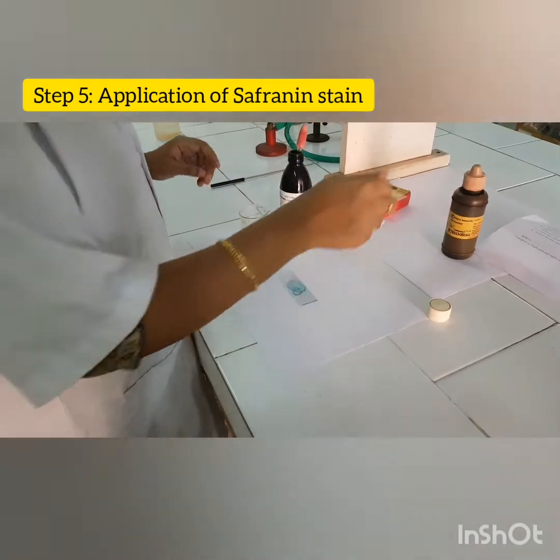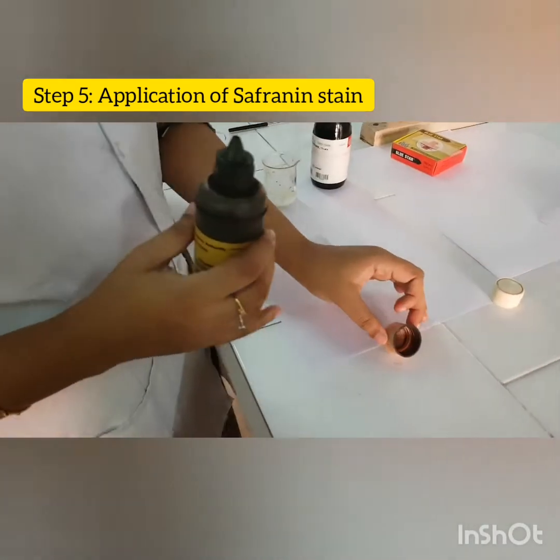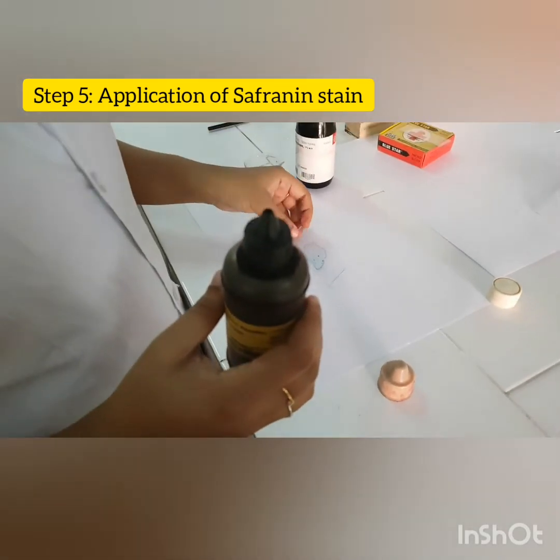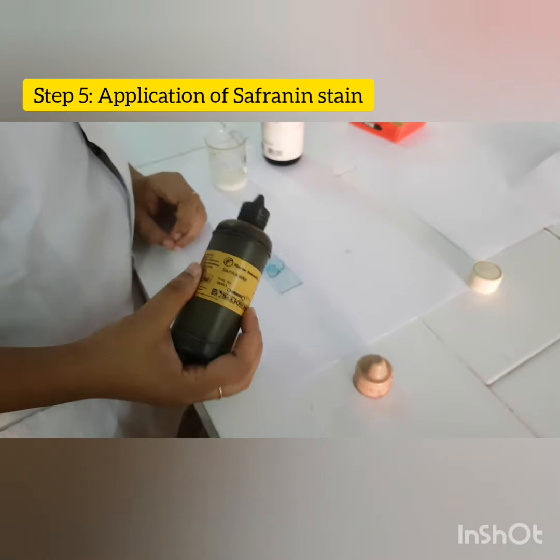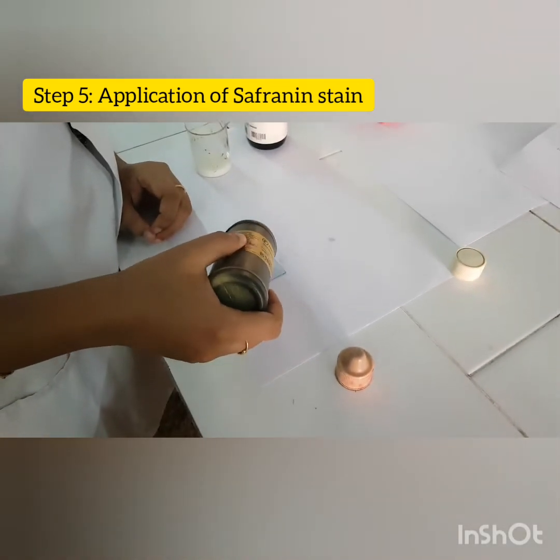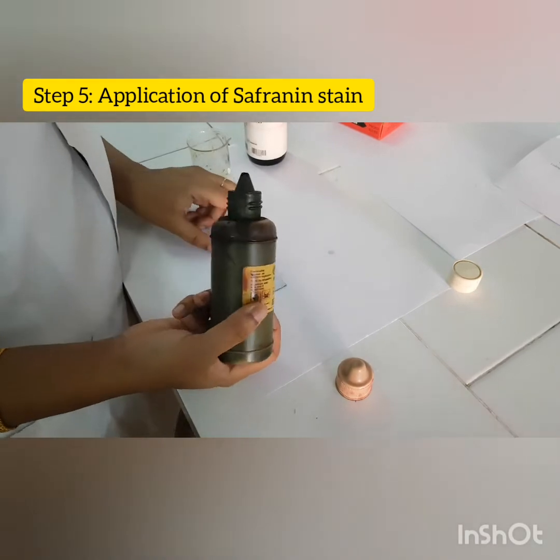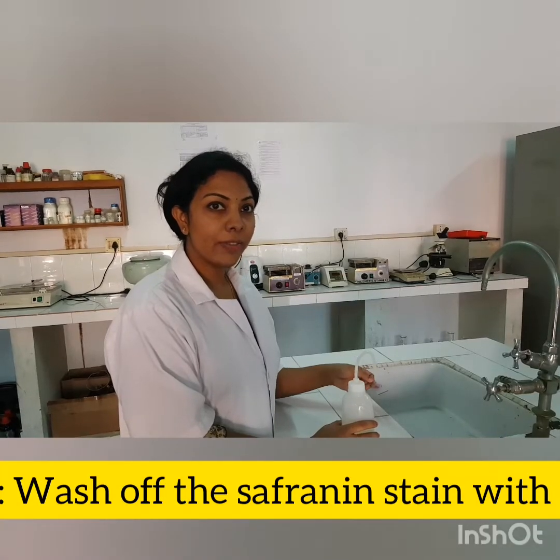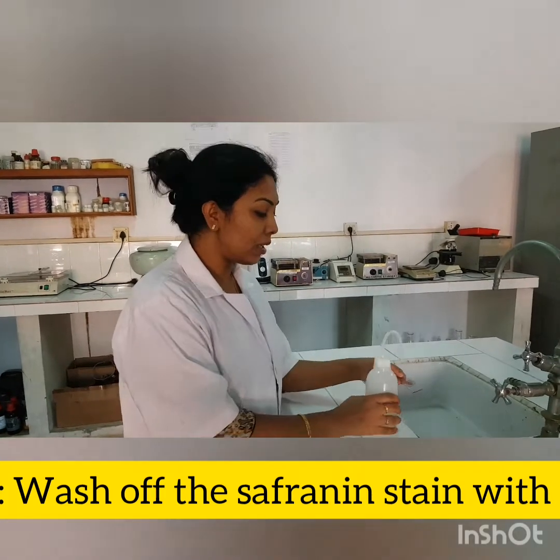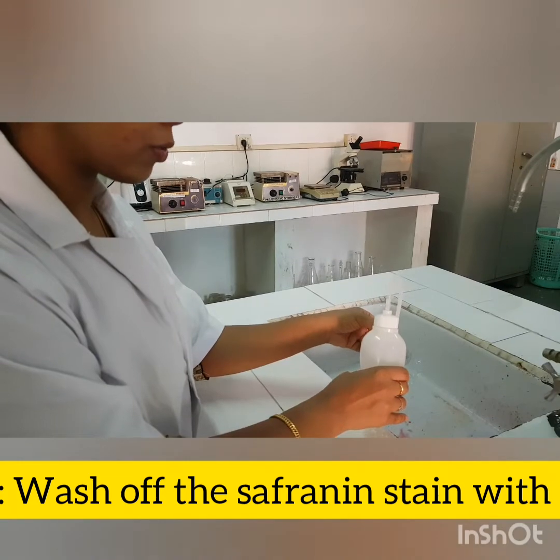After the decolorization, we have to apply the safranin. Cover the smear with safranin. After the application of the safranin, you have to wash off the stain with water. Excess stain should be washed off with water.